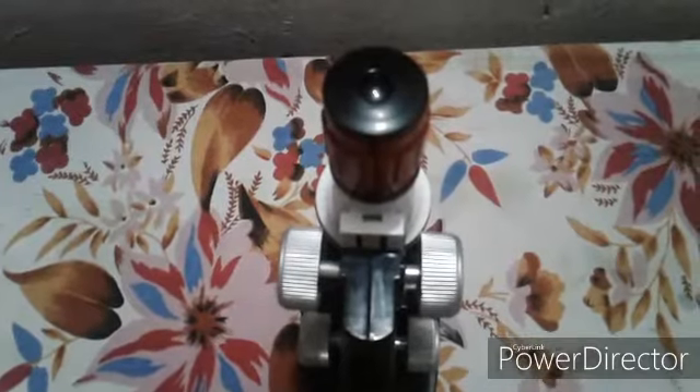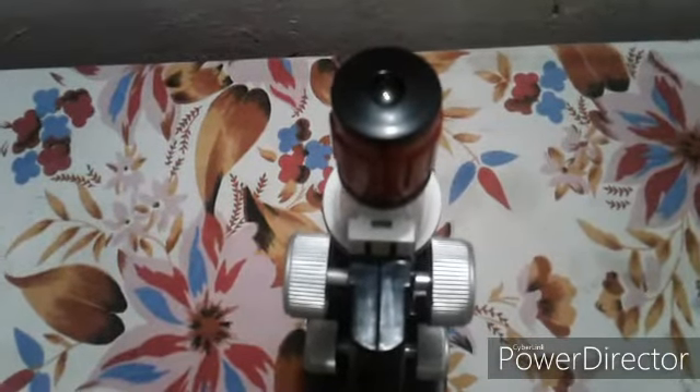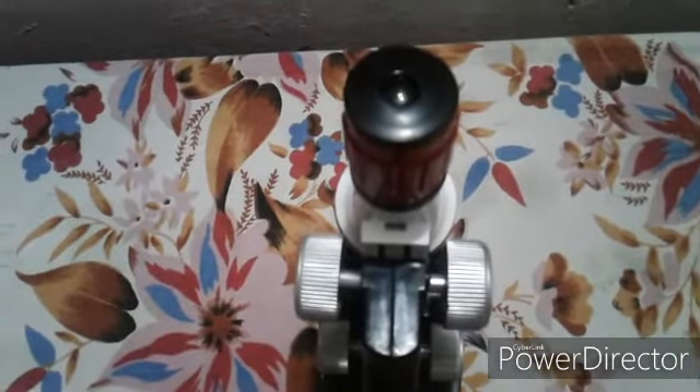I have put my slide under the microscope and now we are going to check it with the camera. You can easily see that these are our stomata cells.